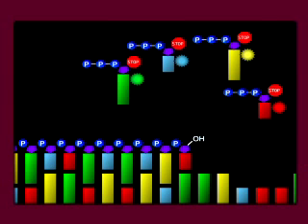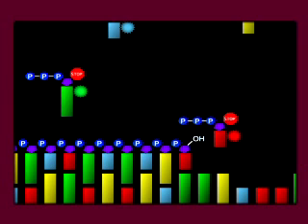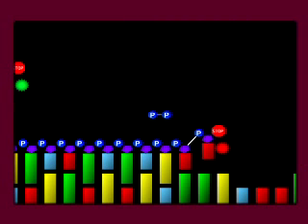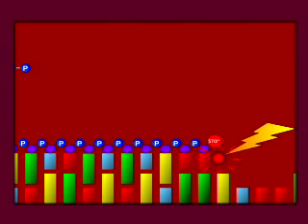Unlike Sanger sequencing, all of the nucleotide bases are labeled with fluorescent dye and have terminators. That means the polymerase adds only one labeled nucleotide to each strand of the sample DNA, then stops because of the 3' terminator. A laser excites the dye, which flashes with the color corresponding to the base. The color of the flash is detected by a camera.